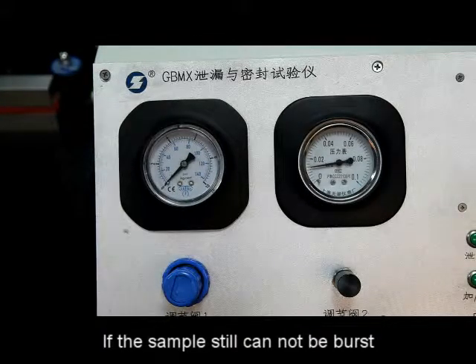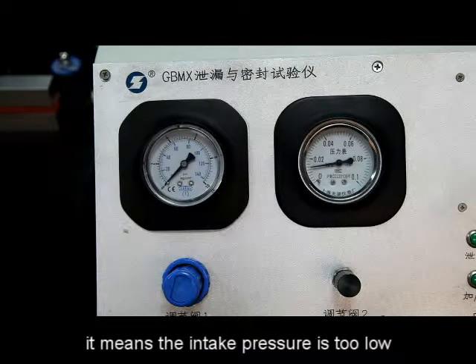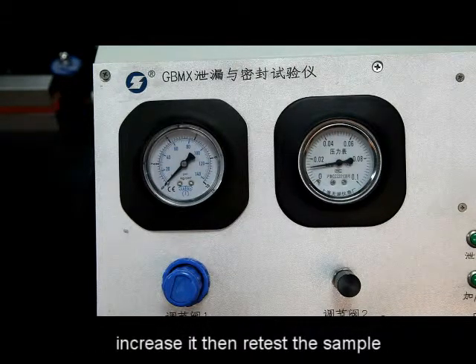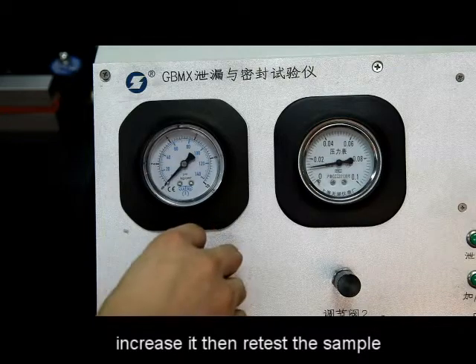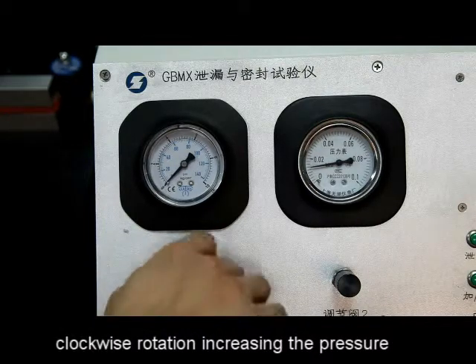If the sample cannot be burst when achieving the maximum pressure, it means the intake pressure is too low. The control valve needs to be adjusted again — increase it, then retest the sample. Clockwise rotation increases the pressure.